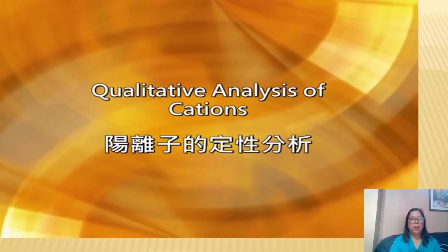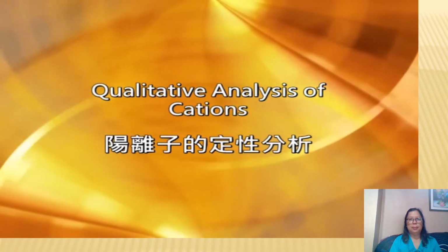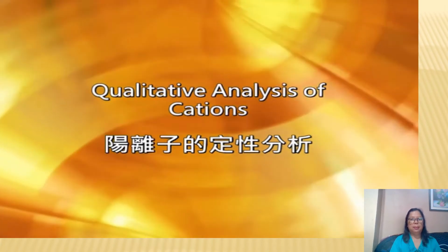Okay, here are some illustrations of your qualitative test for cation. Qualitative analysis of cations.